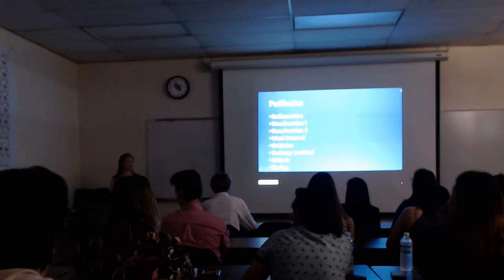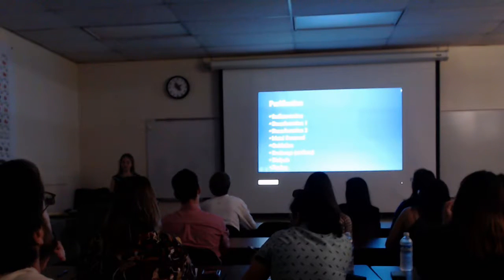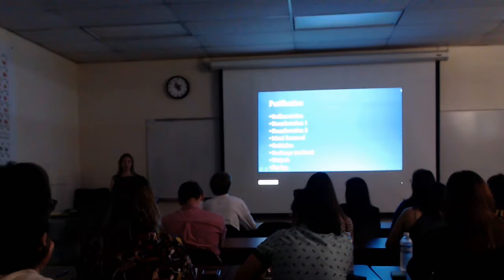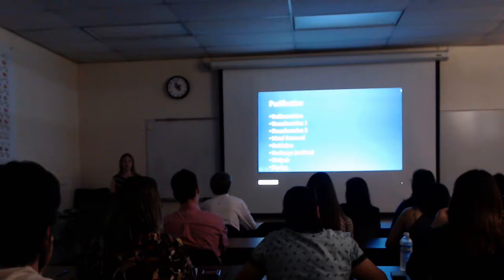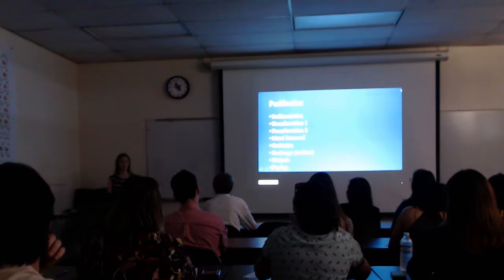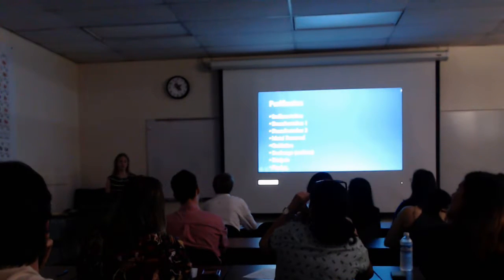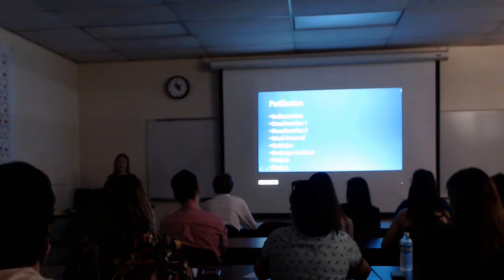So purification occurs through a sedimentation phase where you settle out all of the things that are not clay from the clay. 2 decarbonation phases, a metal removal, and oxidation, an exchange with sodium chloride in order to ensure that the clay is 1 molar sodium chloride, dialysis to remove all extra ions, and you can react the dialysis water with silver nitrate so that a precipitate of silver chloride will come out. And once we have no more silver chloride removed, then we always go 2 changes of the dialysis water further to ensure that we've removed all of the ions. And then the clay has to be dried.